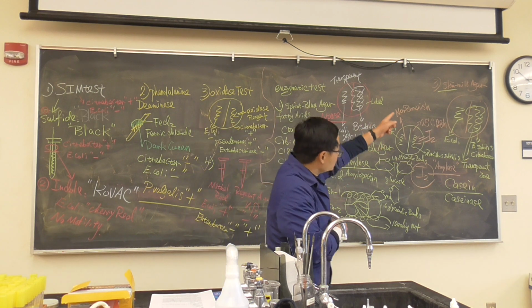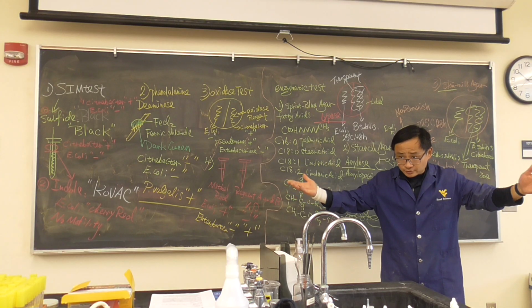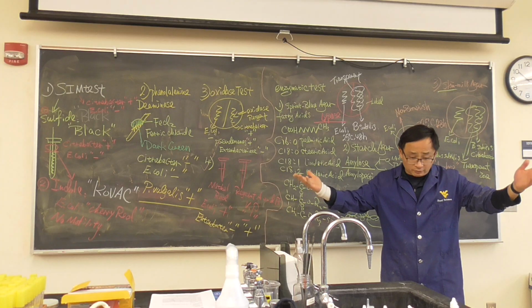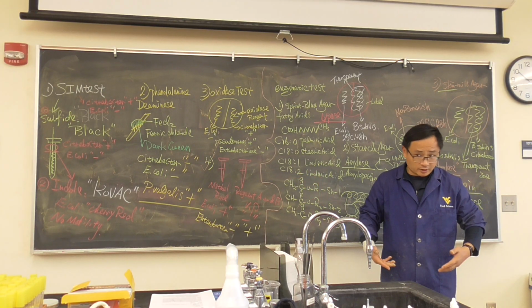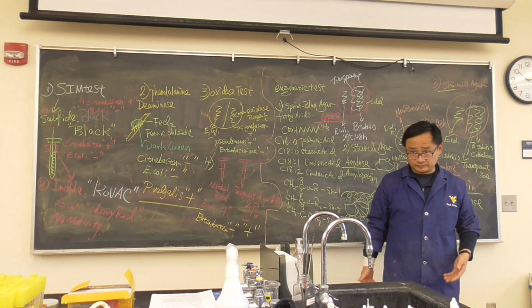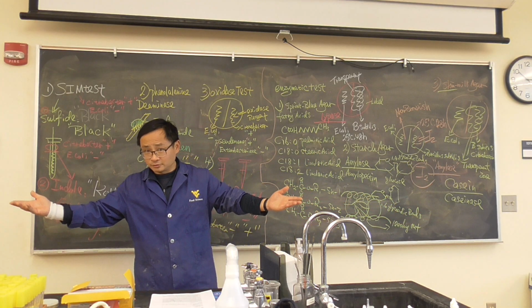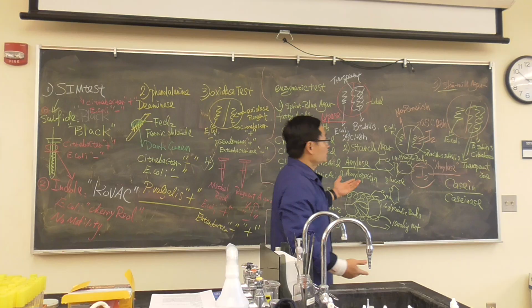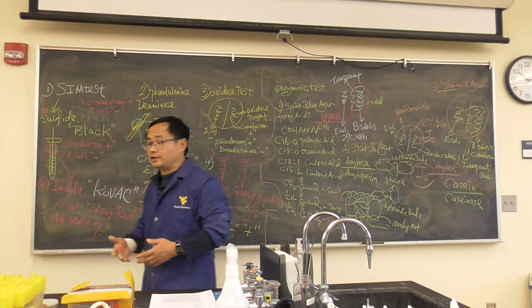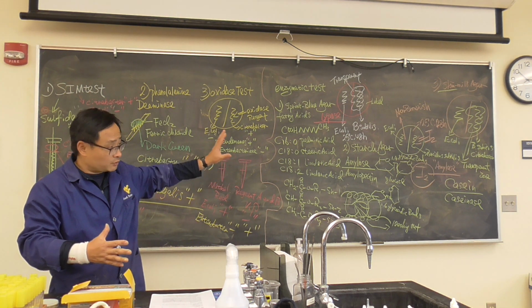And what are the components inside the milk? The sugar is called lactose. That's why some people cannot drink milk. You get diarrhea, nausea, because of lactose intolerance. You don't have the glycosidase. Okay, I want to have some reaction. Okay, that means your chemistry is good. We are talking about biochemistry. So again, these tests are very simple. You inoculate the bacteria, then you see the transparent zone, but the story behind it could go further. Okay, so we want to do these things.